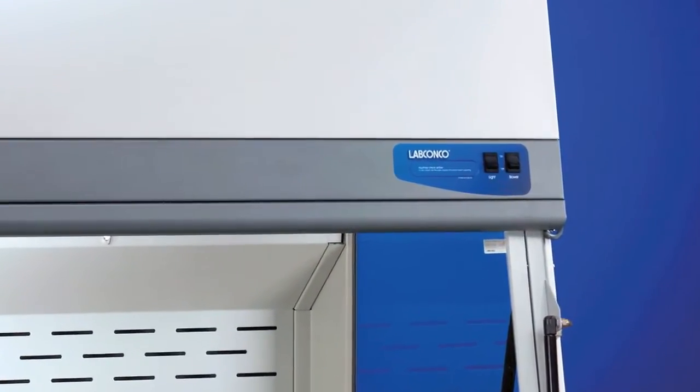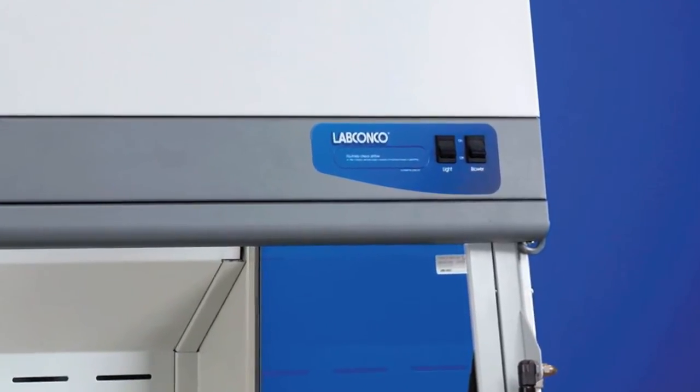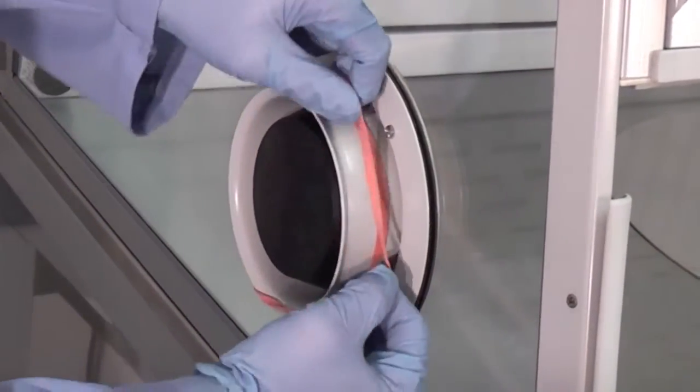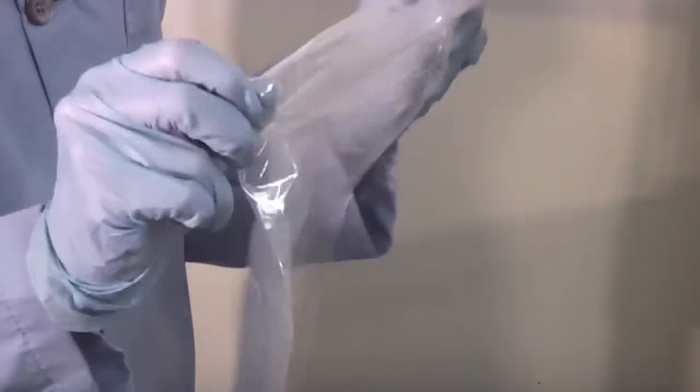To begin setup of the Expert bulk powder enclosure, turn the blower on so that the entire procedure is under containment. Install the waist chute bag by placing the retaining band around the waist chute flange. Fold back approximately 1 inch of the lip of the bag.